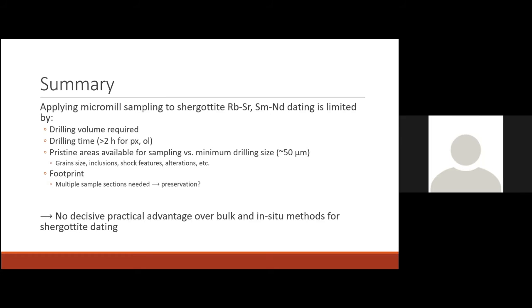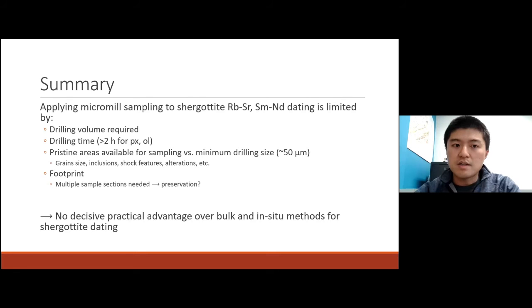Thanks, Alex. Nice work. I just wonder, you can improve on drilling time if you can use a different bit, because usually this kind of bit is good for carbonates, but we're working on hard minerals. So maybe if you use a different bit tip, you can get a lot of improvement in the drilling time. Yes, that is definitely taken into account as well.